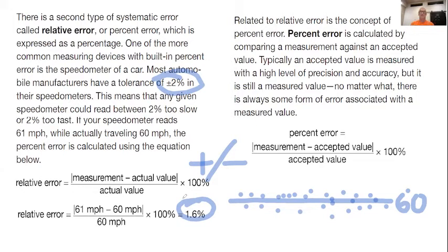So that's something you'll be doing tonight, because the absolute error in measuring something in a 50 mil cylinder is always going to be more than the absolute error measured in a 10, because you're measuring larger volumes. Now, the relative error may be the same. So that's why we need to look at the relative error.